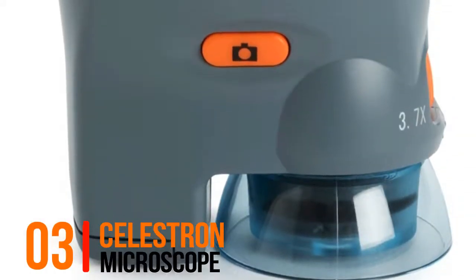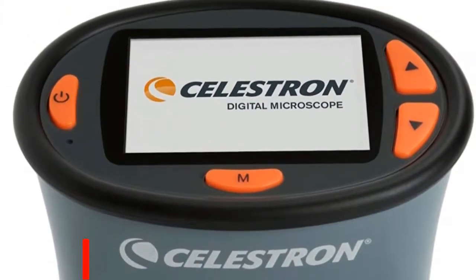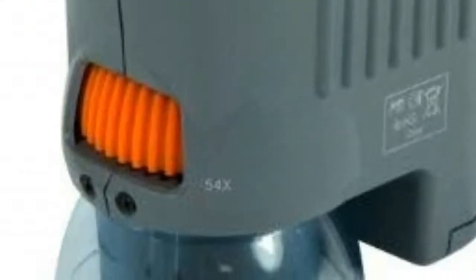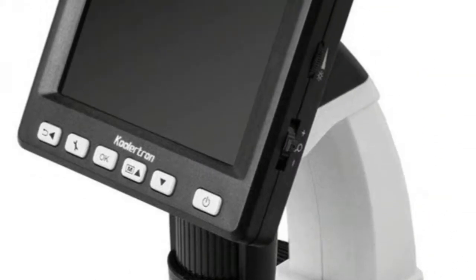No.3 Coolertron Microscope: built-in 3MP digital camera with 1x to 3.7x optical zoom, up to 54x magnification, and 128MB internal flash memory.